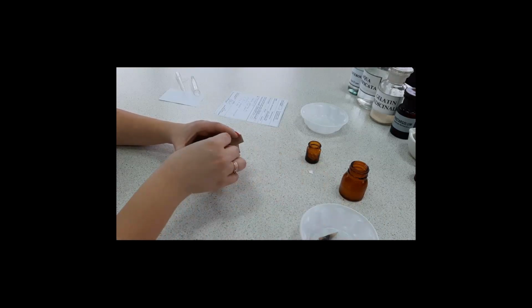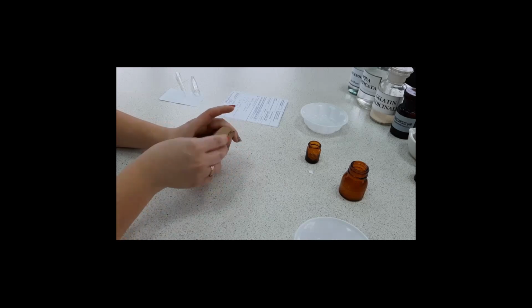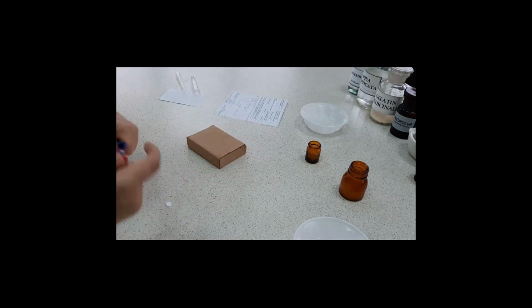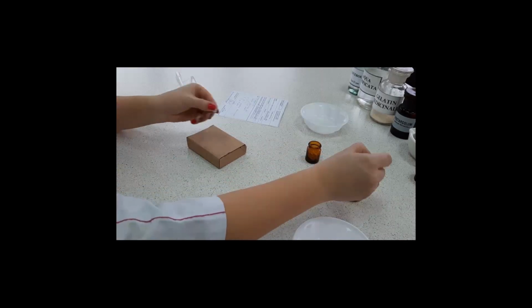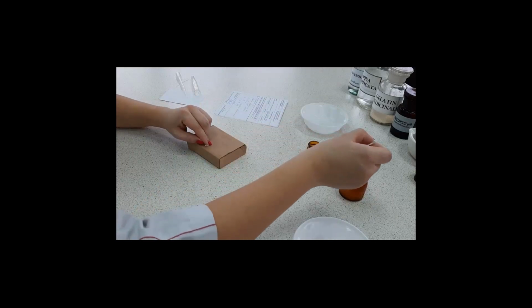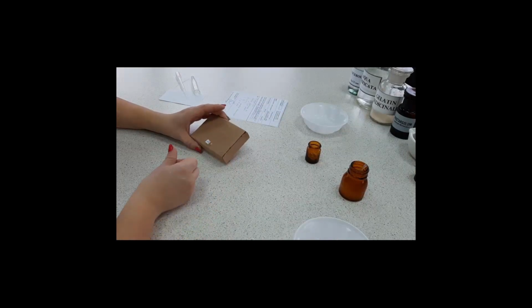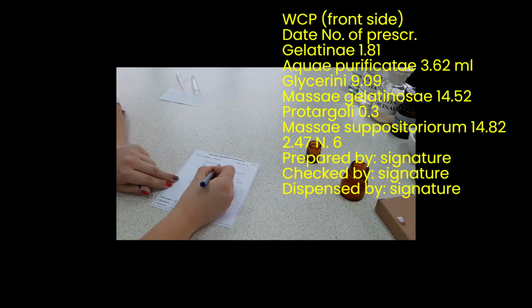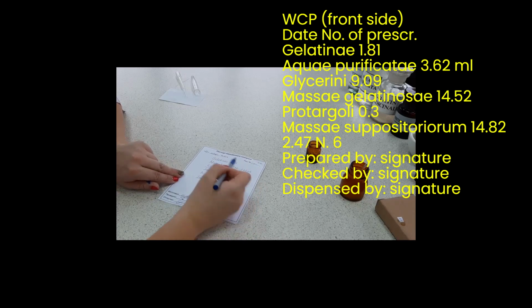Place the wrapped vaginal suppositories in a cardboard box for dispensing and glue the prescription number. Give the medicine to the pharmacist analyst for quality control. Fill in the front side of the written control passport from memory.